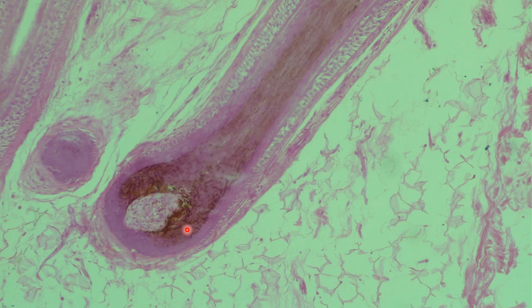So here we can see the hair papillae, okay? That hair follicle, very nice right here. And you can see the hair texture that's coming up. So this is a nice histology slide indicating that hair follicle down at the bottom, the hair papillae, and how it's going to push through.